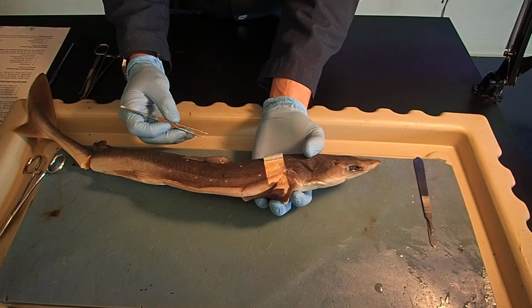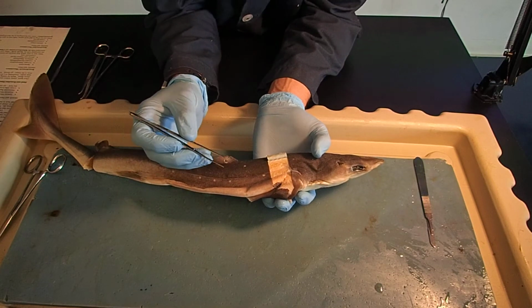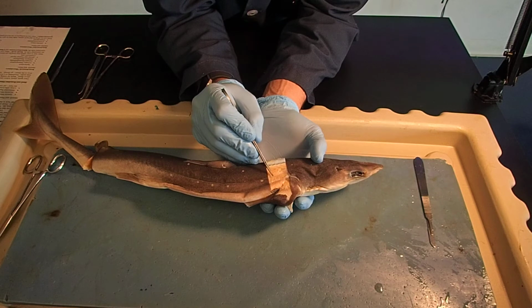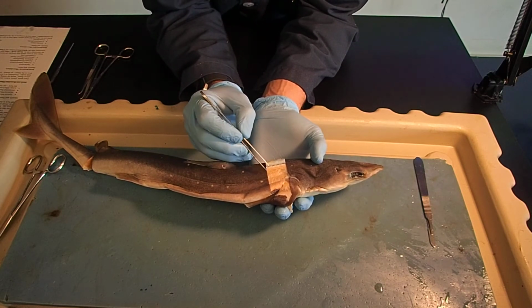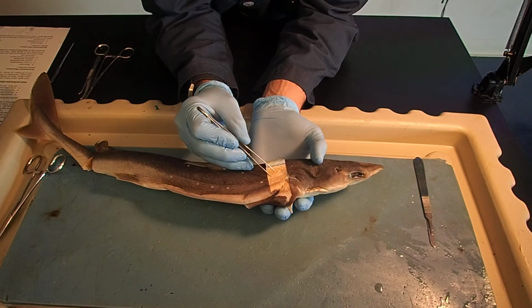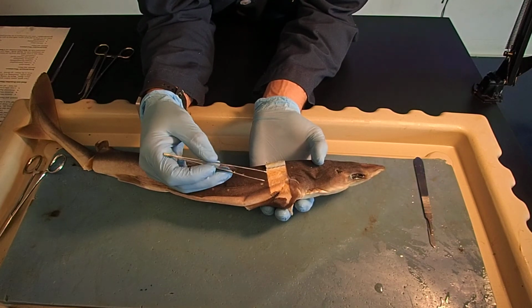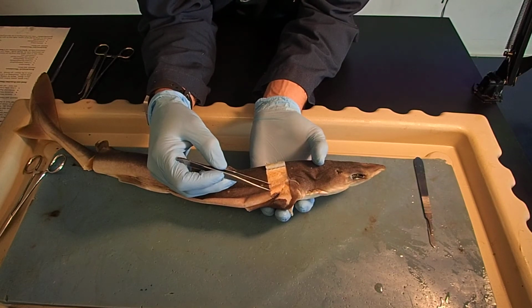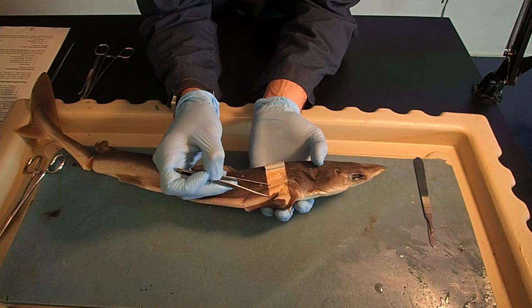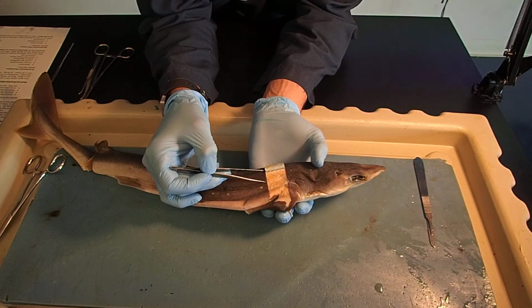We're going to talk more about the function of the lateral line when we get into the nervous system and sensory structures. But for now, if we orient ourselves with this lateral line, and we come up here, we'll notice that line continues underneath the skin as well, within the muscle. This is called the horizontal septum. So here you can see my horizontal septum. Above my horizontal septum, these muscles, right here, these are going to be my epaxial muscles. The muscles that are going to be ventral to the horizontal septum are going to be my hypaxial muscles. Here I have my hypaxial muscles, ventral to the horizontal septum. Dorsal to the horizontal septum, I have my epaxial muscles. All right?